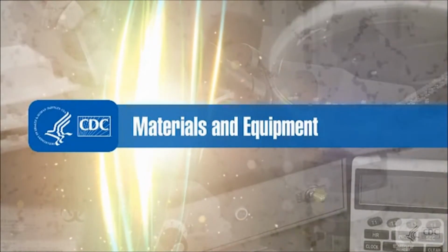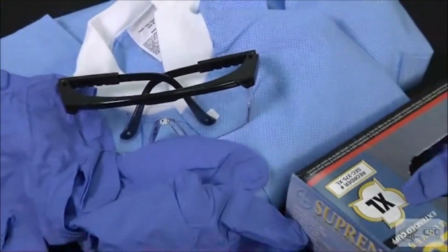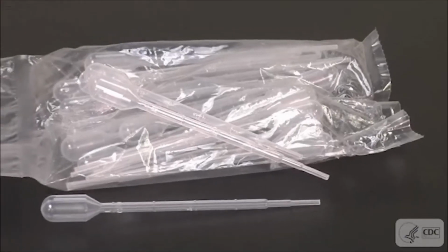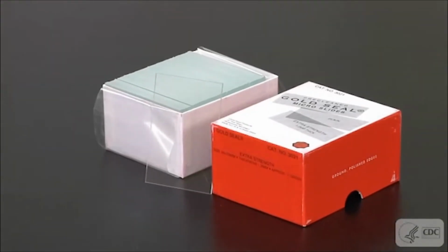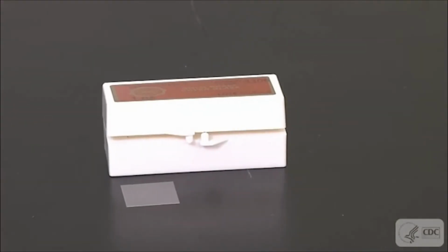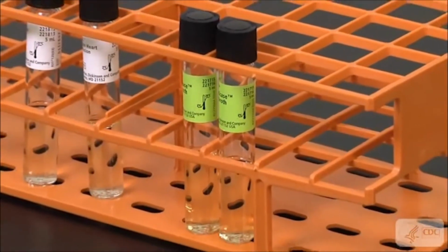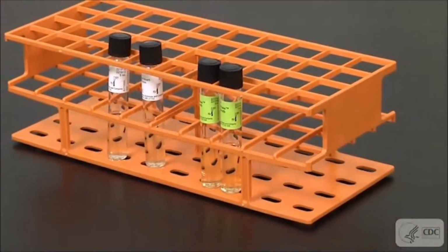For this procedure, you'll need the following: sterile gloves, laboratory coat, and safety glasses, sterile Pasteur pipettes, large 2x3 glass slides, loops and/or needles, and cover slips. For this presentation, we'll be using two types of motility media: motility media with and without TTC.